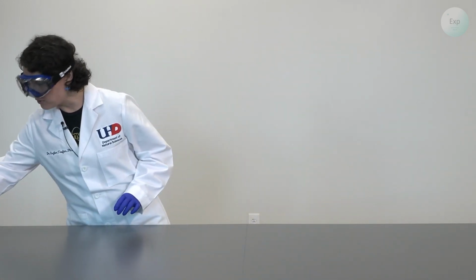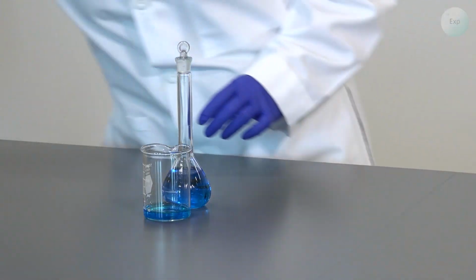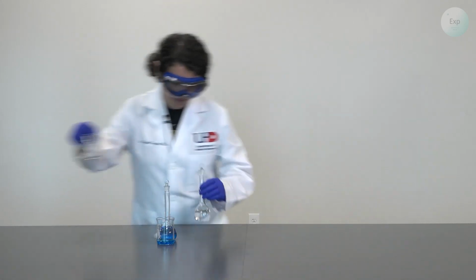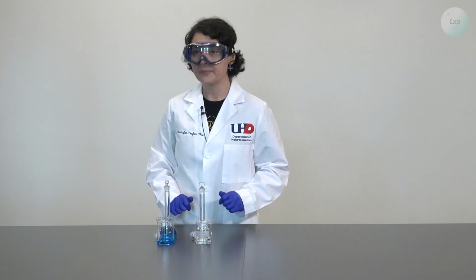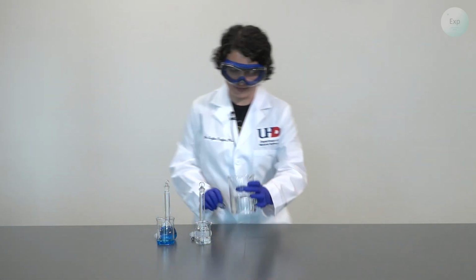So for today's experiment, we're going to have 3 liquids that we will be using. We're going to use the blue food dye that I already transferred into a beaker and the associated syringe. I will use my bleach, which I transferred into a beaker, and I have the associated syringe. And I will be using deionized water with the associated syringe.